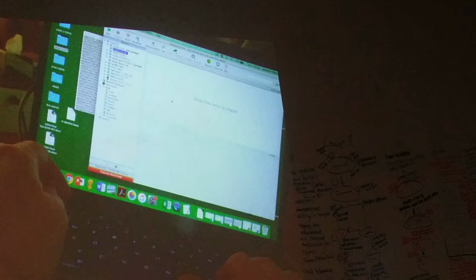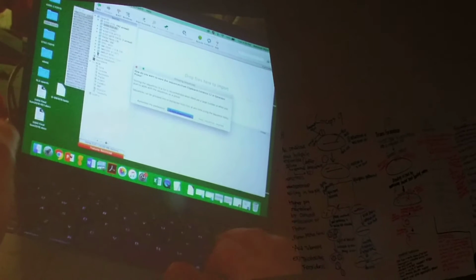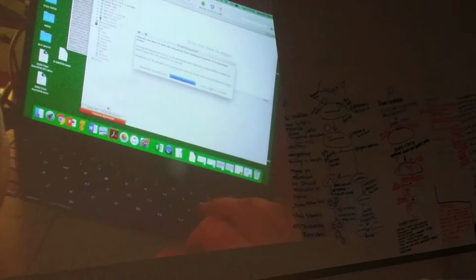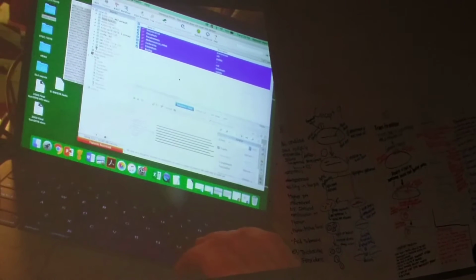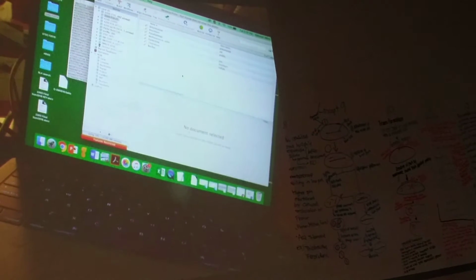Now I'm going to select that folder, and all I'm going to do is say Control V or Command V, depending on whether you have a Mac or a PC. You're pasting those sequences into this folder. It's going to ask you if you want to make a list or keep them separate. You want to keep them separate. So you should be somewhere vaguely looking like this.